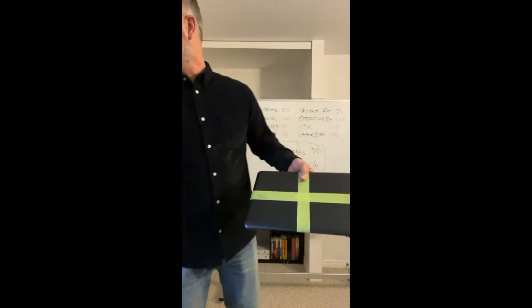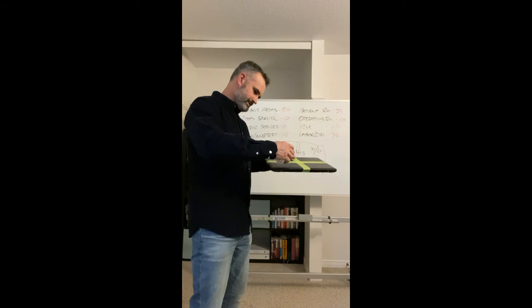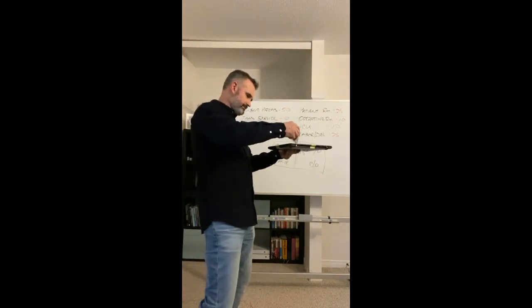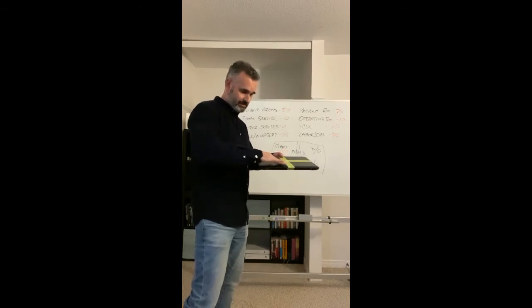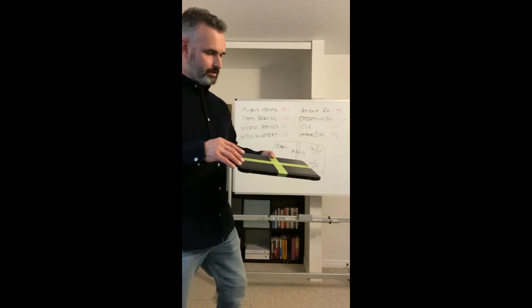Okay, just give me a sec here. Okay, this is a brand new, so we will just go like this. So we got a good amount of sanitizer there, and you should be using a good amount. If sanitizer is your only option, that actually fell off. Let's try that again. If sanitizer is your only option, don't be sparing with it. You should be using a fair amount. So we got the sanitizer on there. We'll let that dry up.